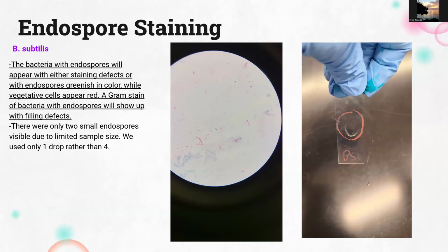But yeah, this one was a really interesting one that we weren't able to see too much, but we ended up finding one endospore in that entire slide. Actually, two. There was one somewhat far off.